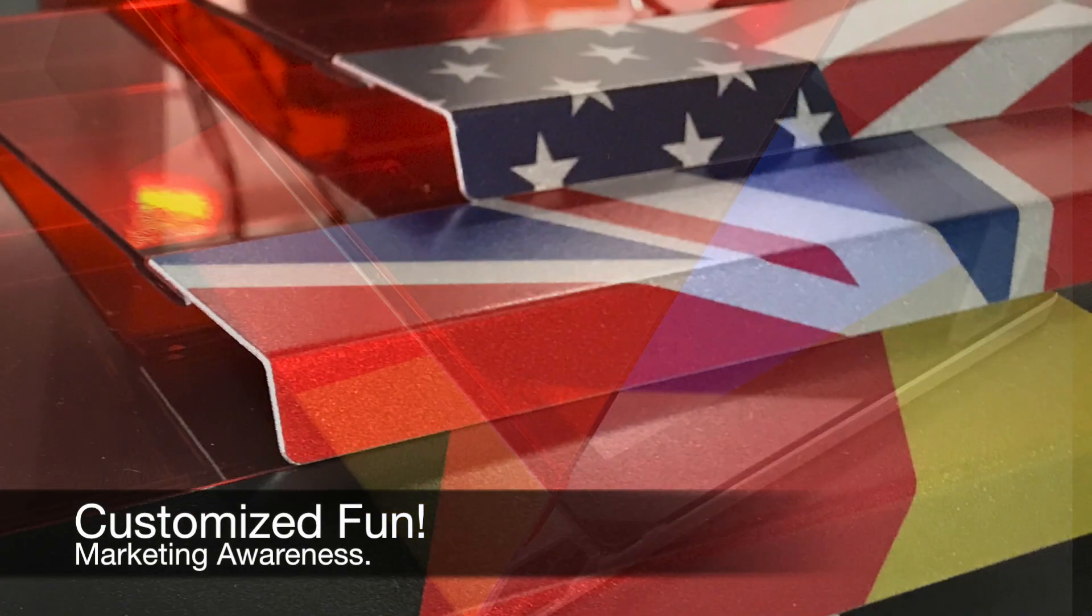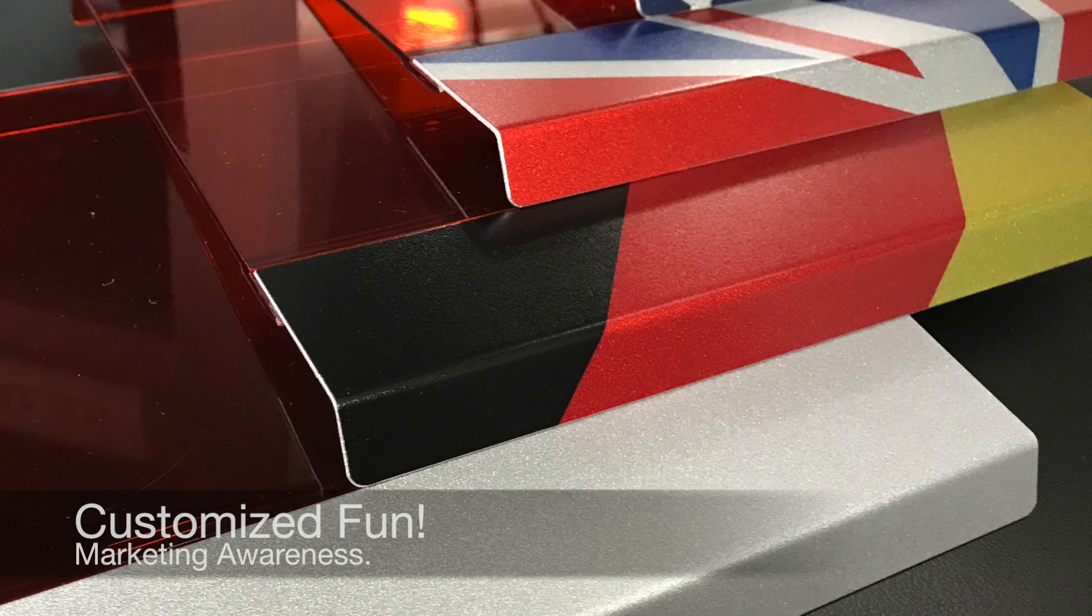So enjoy a smart illuminated day without feeling the harm from the UV and ethidium bromide.